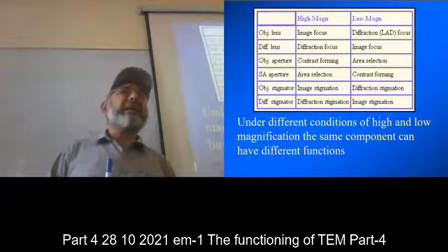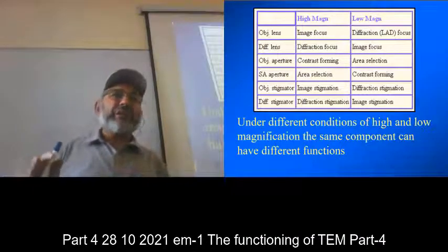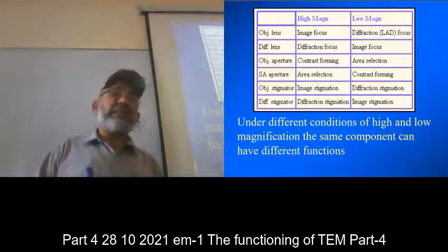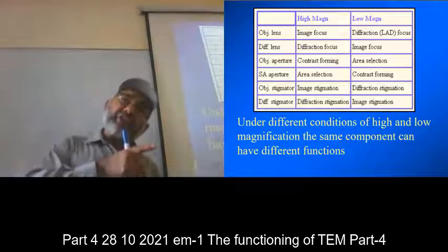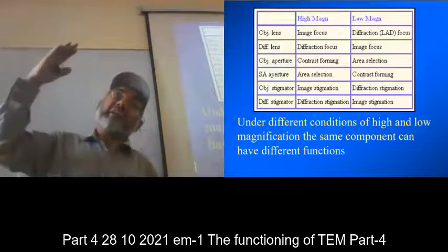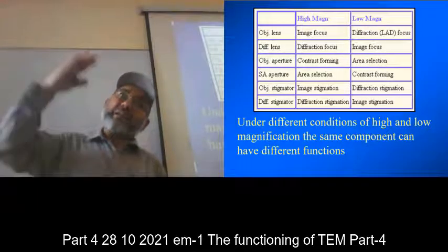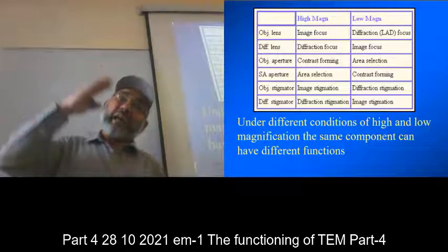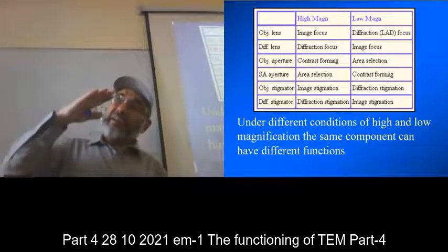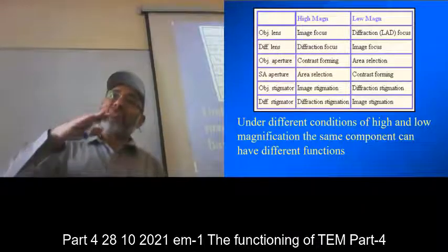They are not color imaging. There is no coloring in those imaging. It is giving you the contrast, and contrast is bright or dark, not white and black. White and black are colors, and bright, dark and gray are contrast.